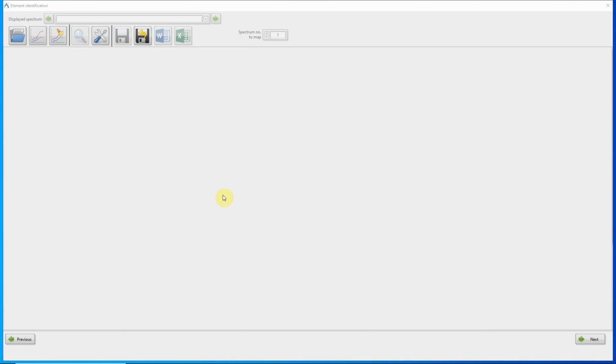The shortcut buttons in the toolbar are, from left to right, as follows. Select spectra for analysis. Select and display spectra previously acquired using LibSoft. Add comparison spectra. Select saved spectra for comparison with the analysis spectrum. Clear comparison spectra. Clear spectra loaded for comparison, leaving just the spectrum for analysis. Analyze spectra. Analyze the currently loaded spectra using the current configuration.